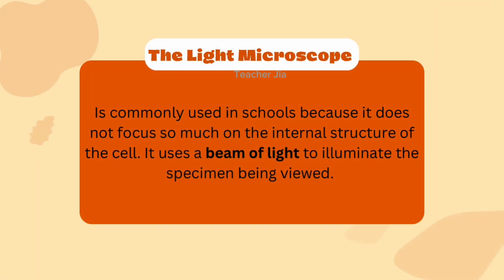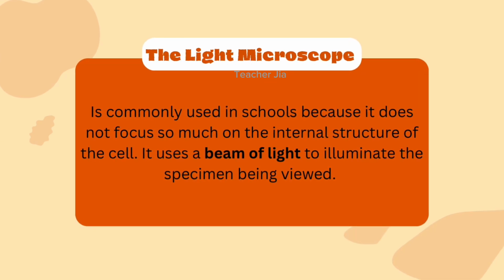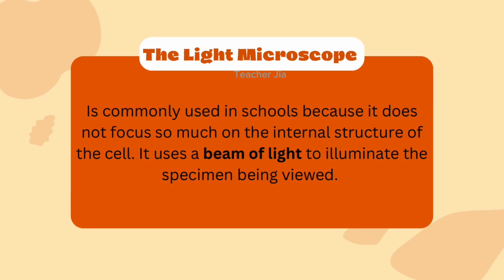It's commonly used in schools because it does not focus so much on the internal structure of the cell. It uses a beam of light to illuminate the specimen being viewed.